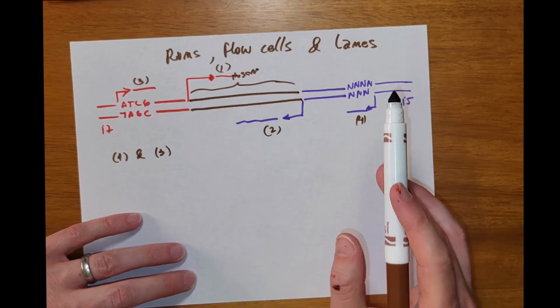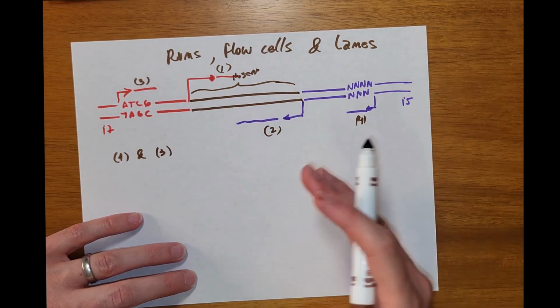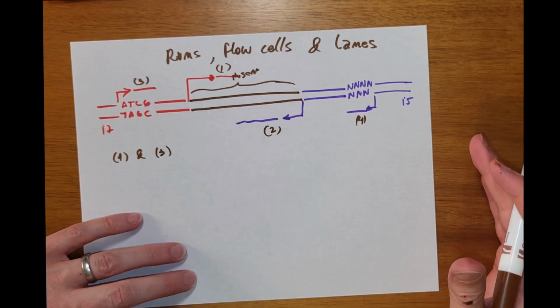This is completely possible. The only problem is that you would need to use all of the lanes of the flow cell, because there will be no other group that will have the same requirements. So bear in mind what the most common types of reads are when you design, because you will need to compromise and fit your reads to the needs of the most common user type. So that is something to bear in mind. It is very practical, but sometimes it creates a lot of problems.